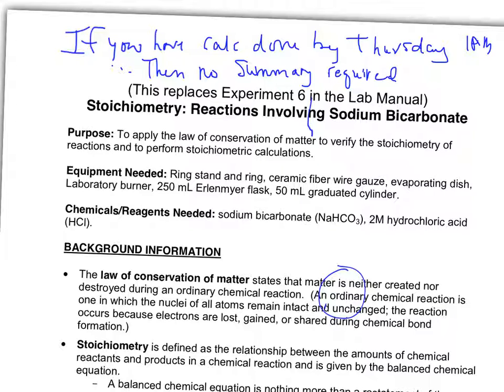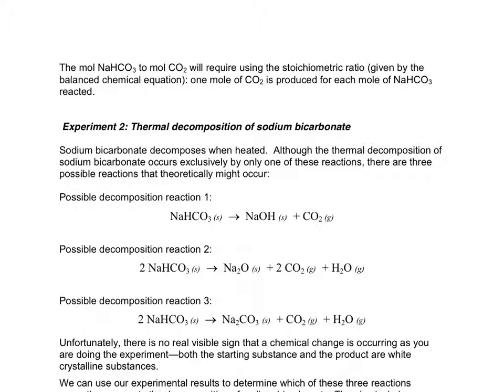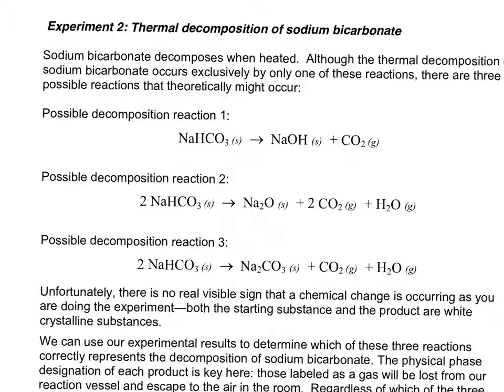But part 1 that you're going to do today is the same as part 1 in experiment 6. Okay? Very good. Include the chemical reactions in our lab report that's due today? Yes. And the second part of your experiment is that you include the chemical reactions. So figure out, this is so exciting, and I told you this is the first time I've done this one. You are going to figure out which of these reactions is going on in your second experiment. Put another way, is it this one? Is it this one? Is it this one?